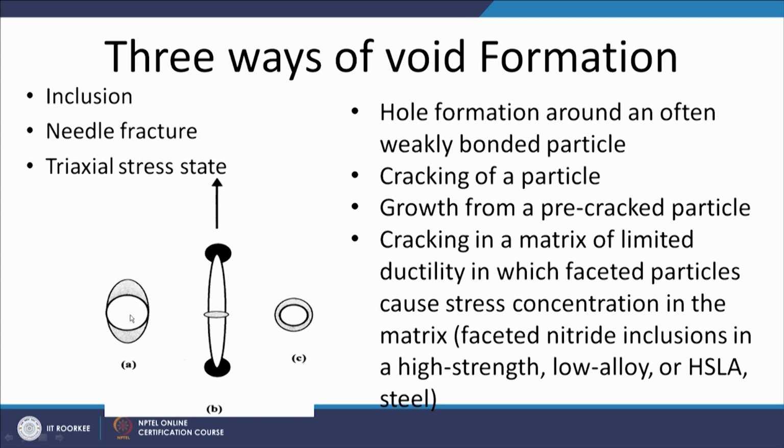When the inclusions are present and the material is deforming, we will see the void formed on both sides, and this eventually causes the formation of the dimples.